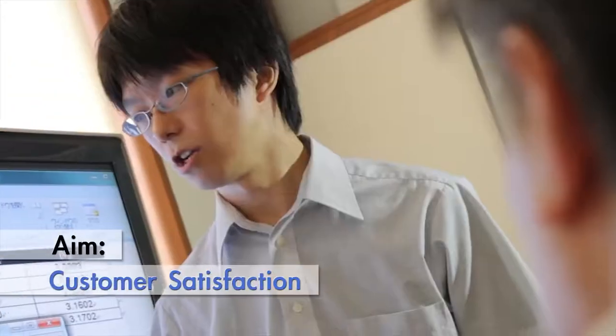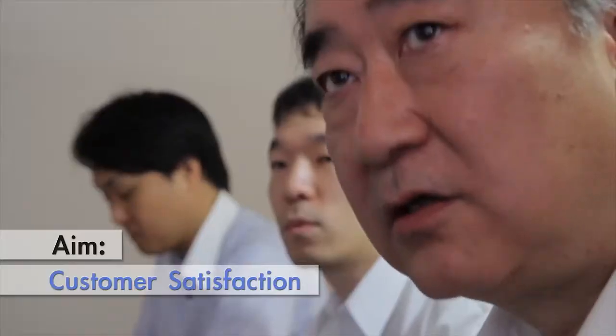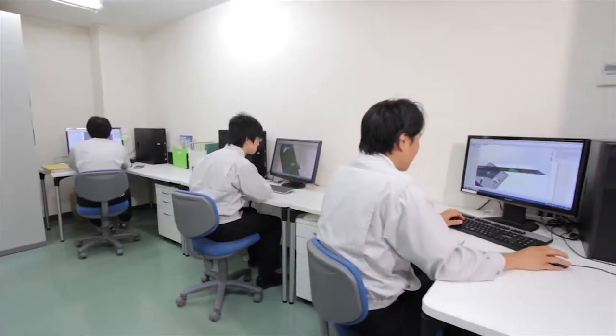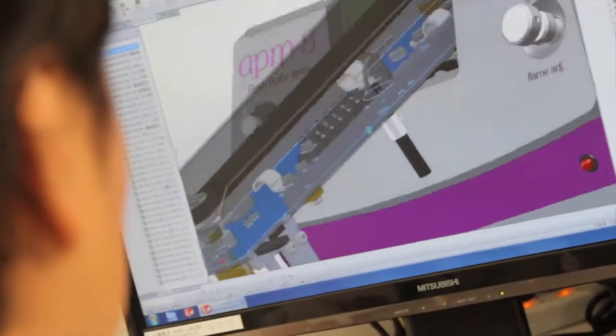Customer satisfaction. This is what the R&D team is always aiming at. Ease of use, simplicity and high accuracy have been sought thoroughly at every single stage of the development.